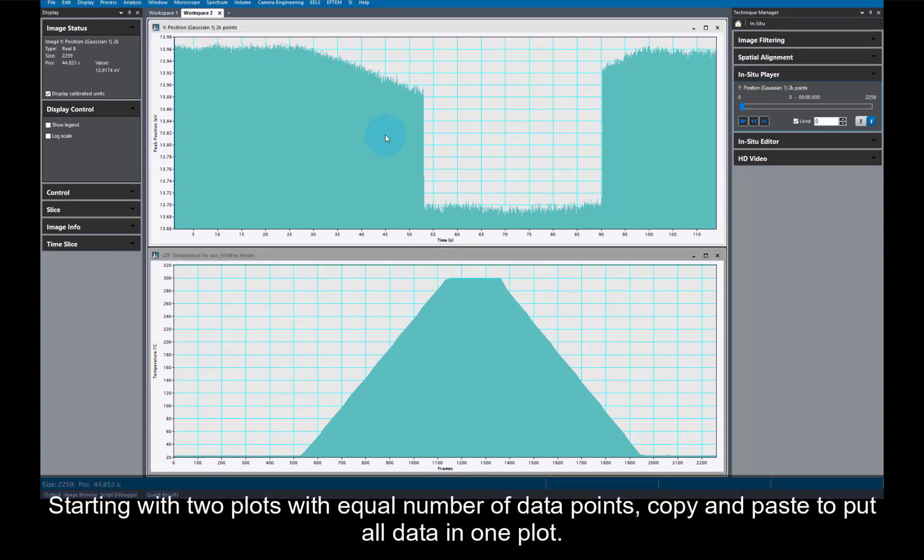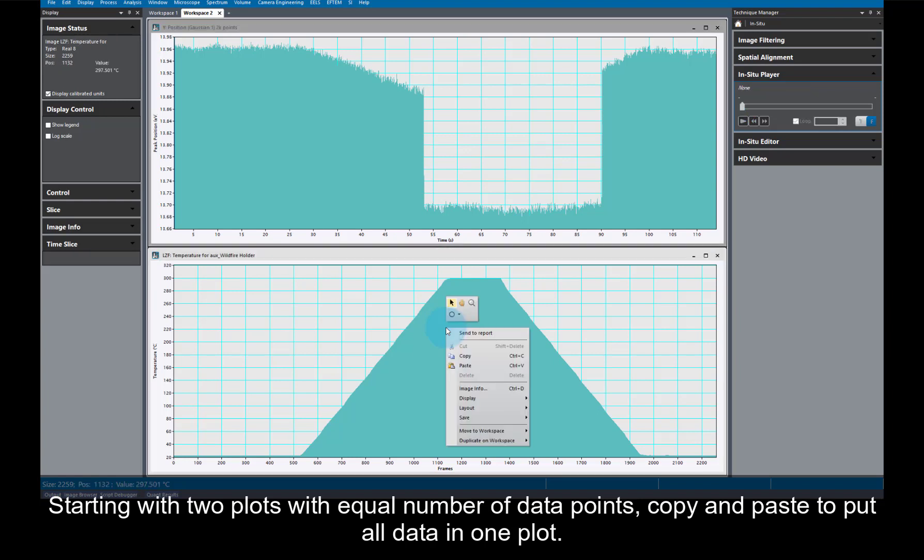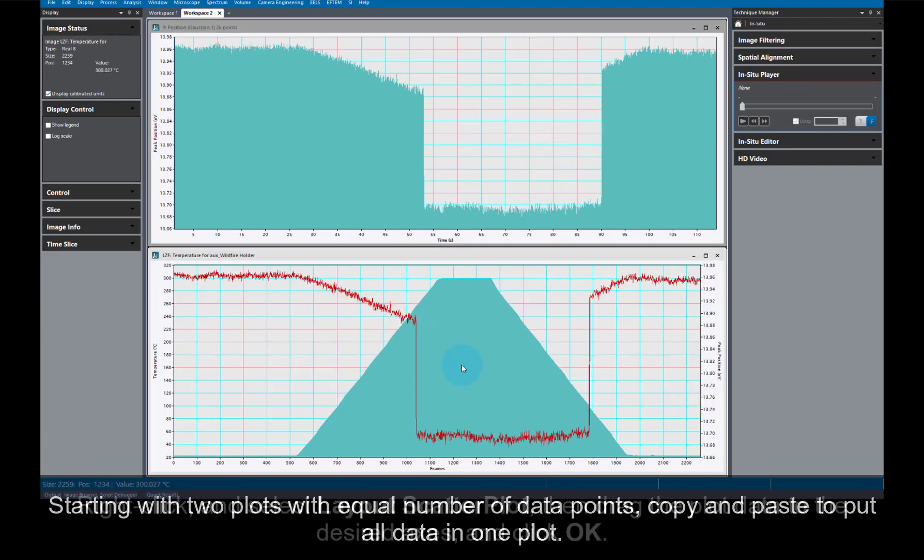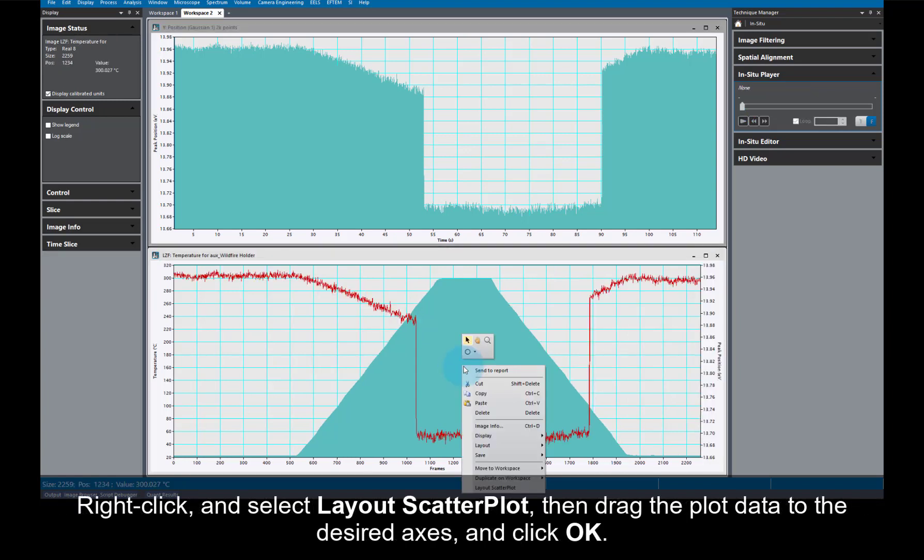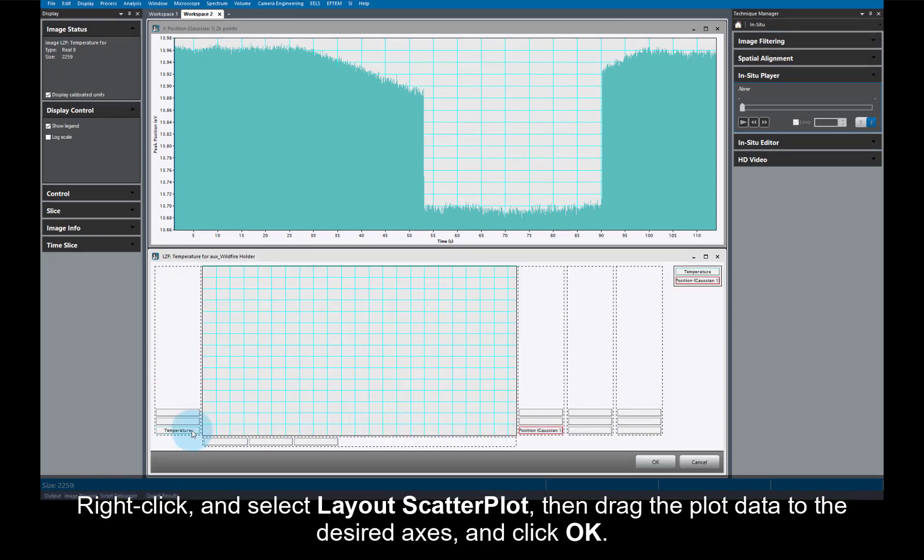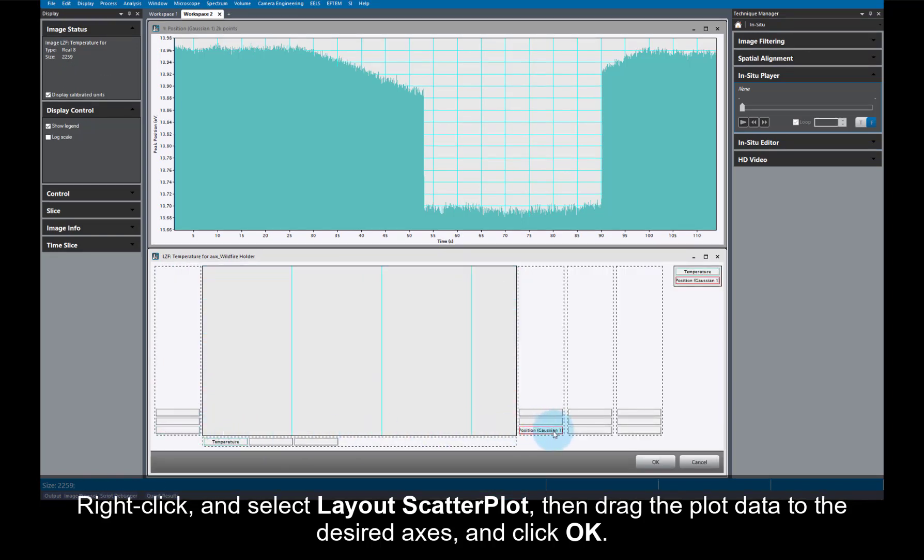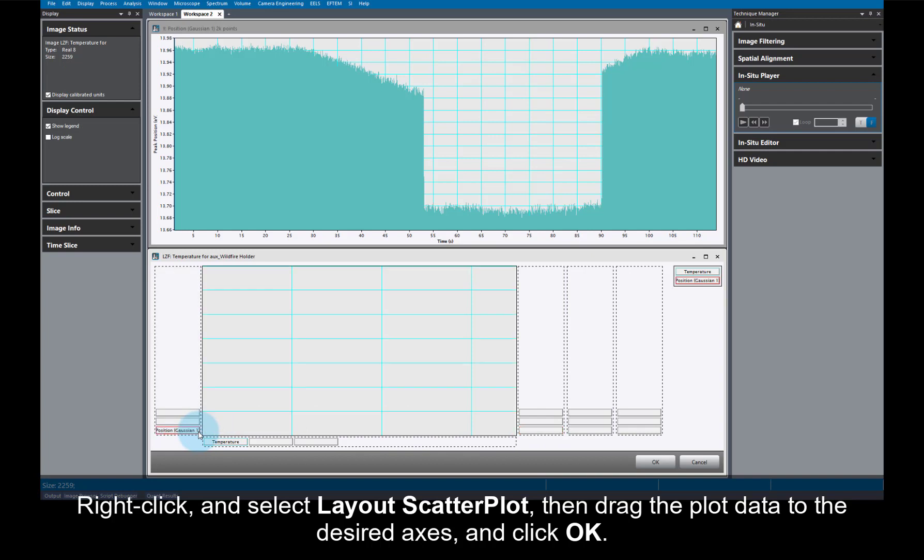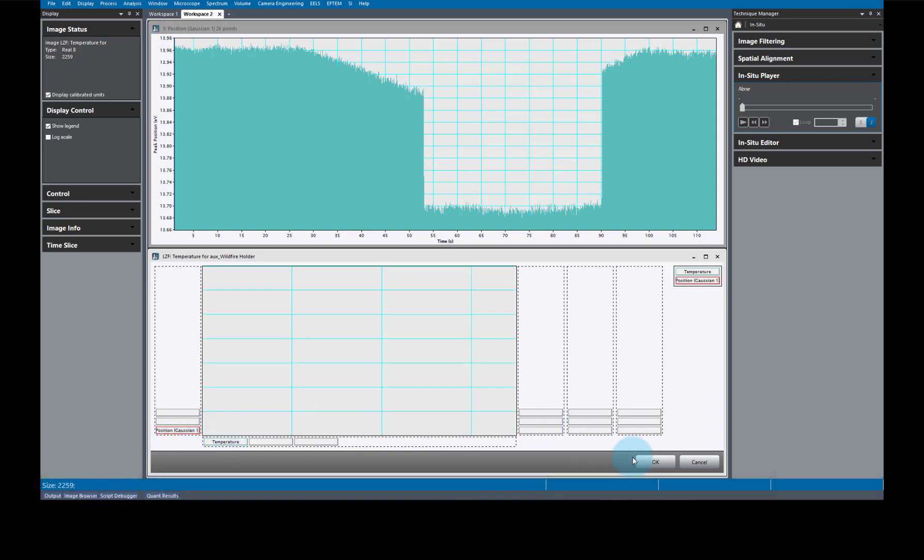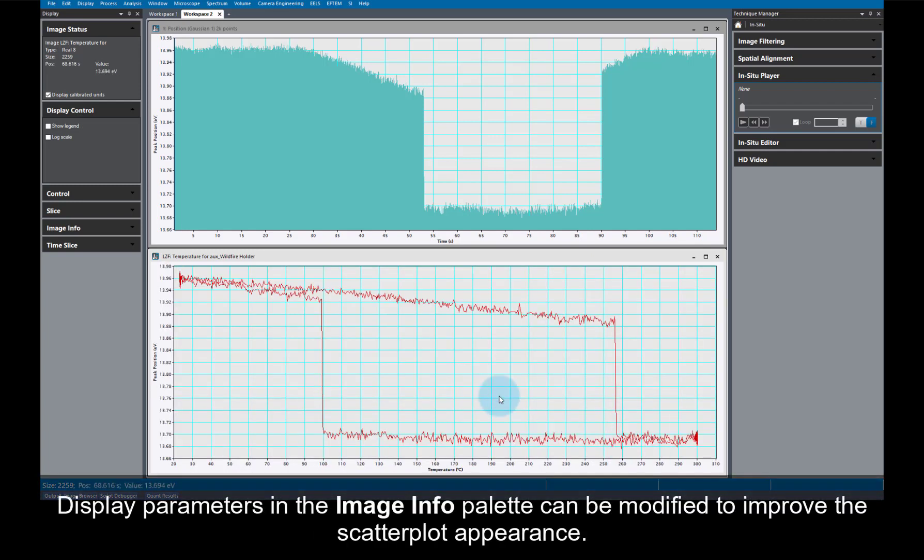First, you should copy and paste the data from one plot to another. Then, you can right-click and select Layout Scatter Plot, and then drag the plot data to the desired axes. Click OK, and voila! A scatter plot.